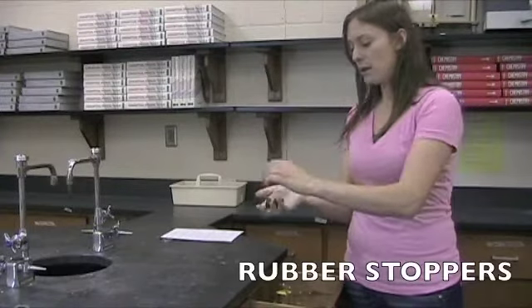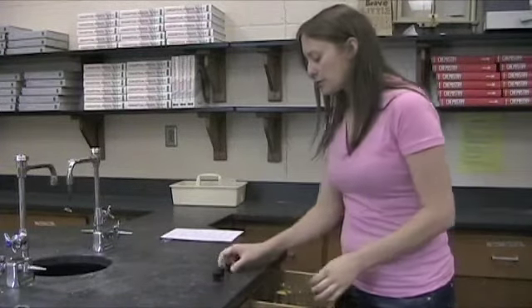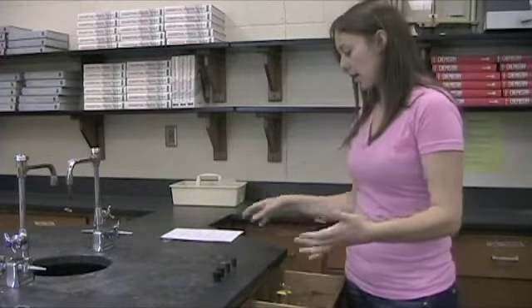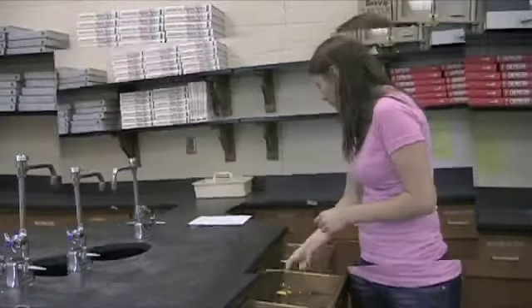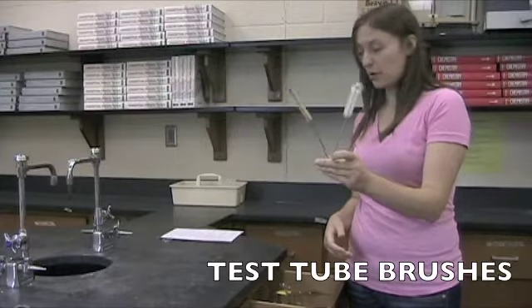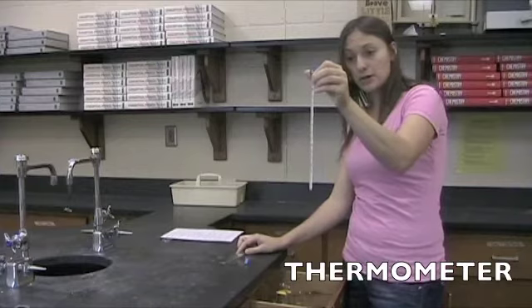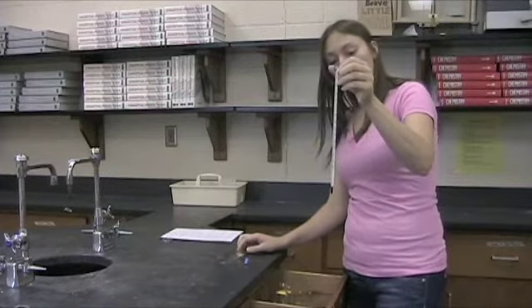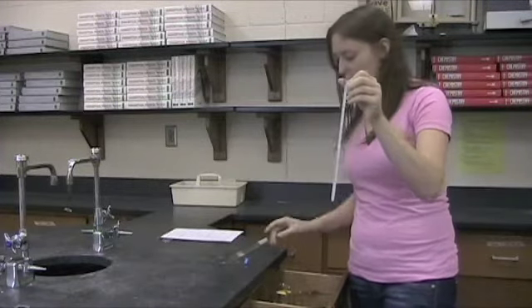Stoppers. There are many different sizes of stoppers. Some of them are one hole, some are two hole, some are just for little test tubes. They have many, many different uses. Test tube brushes. You use to clean your test tubes or the beakers. Make sure your stuff always stays clean. You'll have a thermometer. Thermometers are, for us, measured in degrees Celsius. And all of ours, I think, are blue. So then you read the temperature on there.